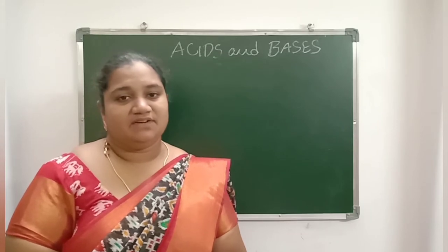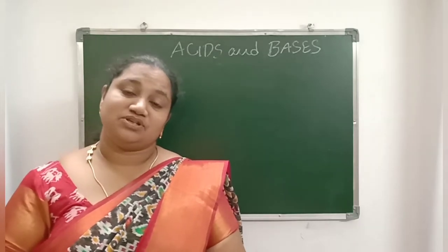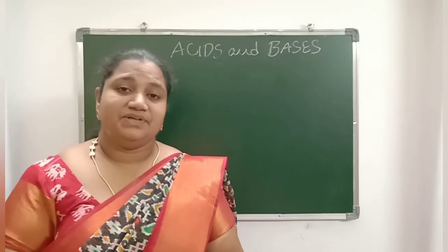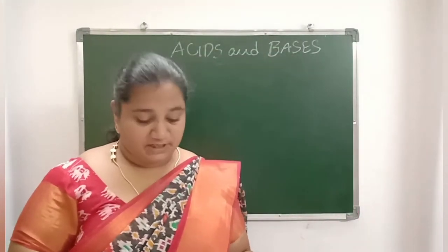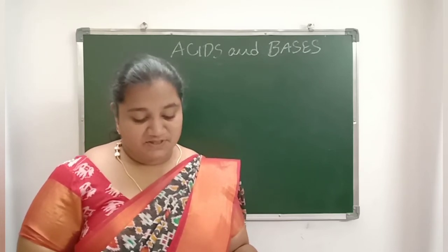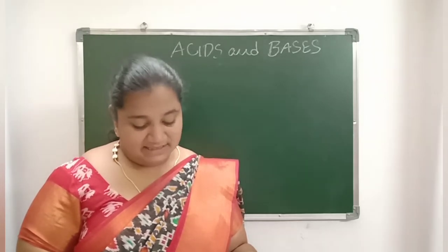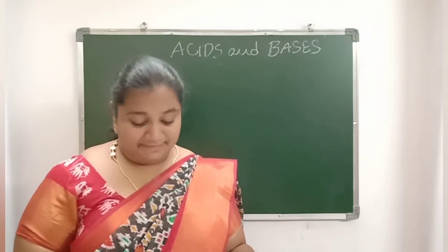In the previous class we learned about hydrogen gas, Henry Cavendish, who discovered hydrogen gas, and also about acid rains. There is one more experiment which explains the release of CO2 gas, on page number 14. Take lemon juice in 2 test tubes, and add some pieces of marble to one test tube and eggshells to another. What do you observe? Bring a burning matchstick near the test tube. What happens? These are due to the release of some gas. Pass the gas into lime water. What happens? Can you see the formation of a precipitate?